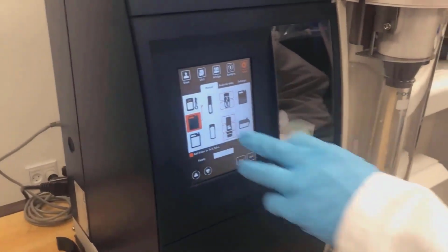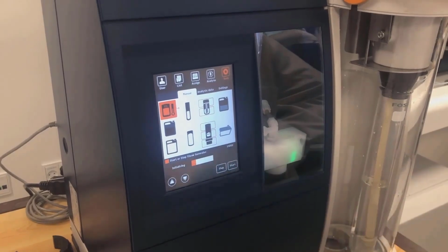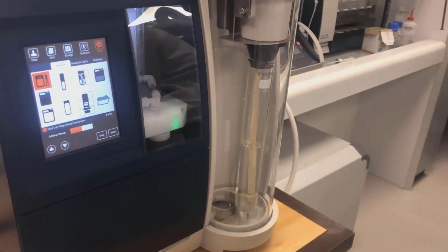Yeah, then we move to the next step. You can choose add steam. Press that. Then the steam will be added now.